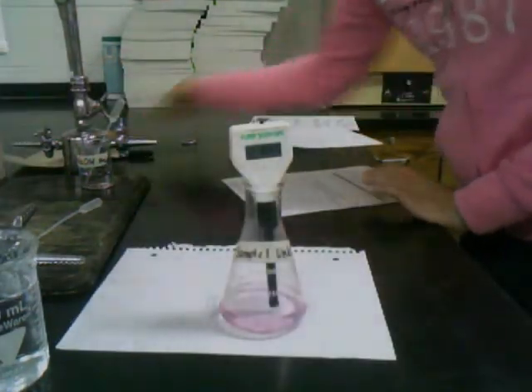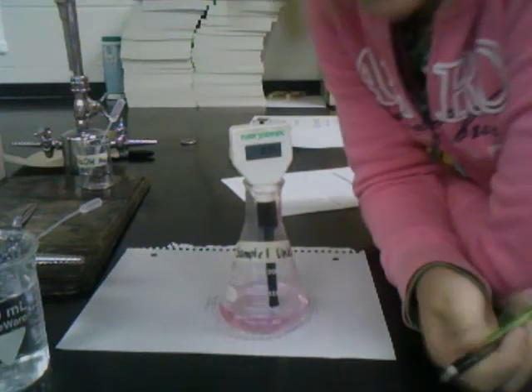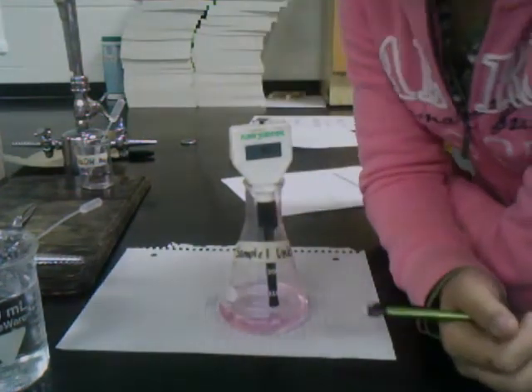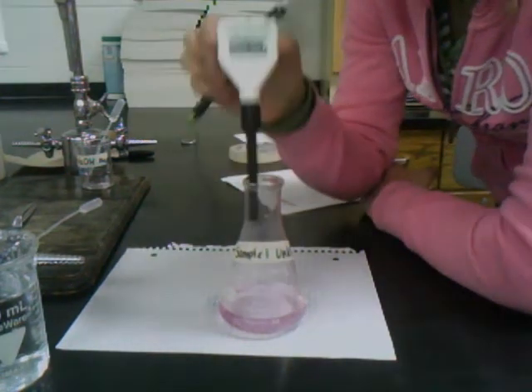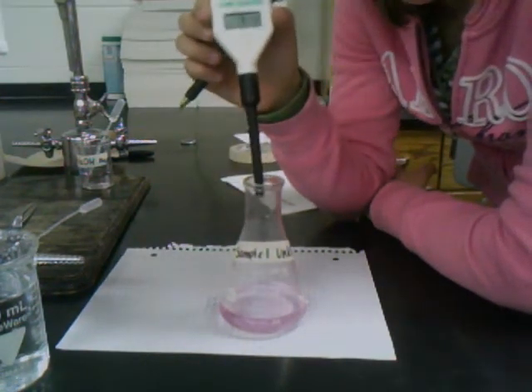Right now it's reading slightly basic, so we think we may have over-titrated it. It's at 9.14. Now I'm going to place this back in the water so I can make sure I've rinsed off all of that solution.